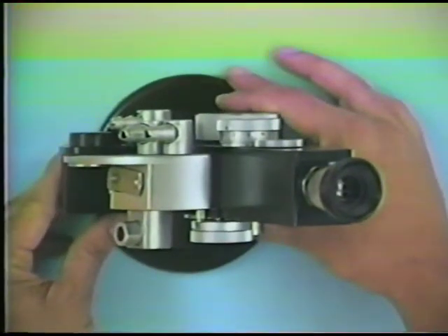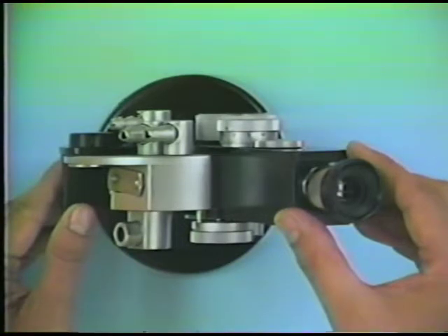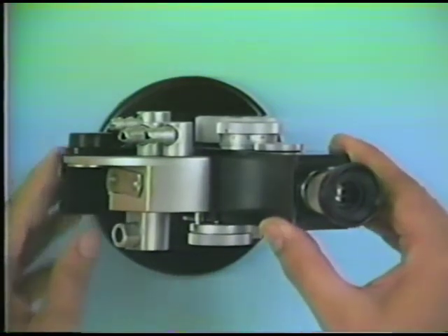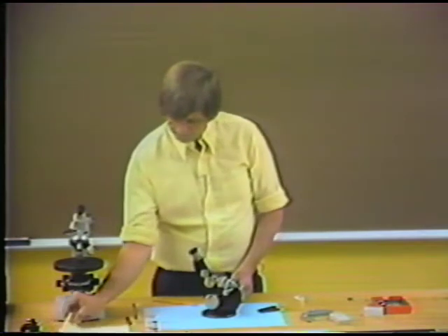And you can never trust the labeled index of refraction that's found on a particular index of refraction liquid. You should check these things repeatedly, because they evaporate and the index of refraction changes.